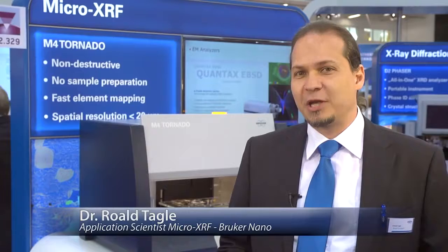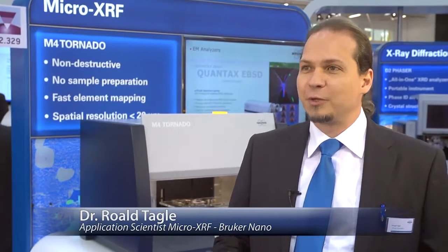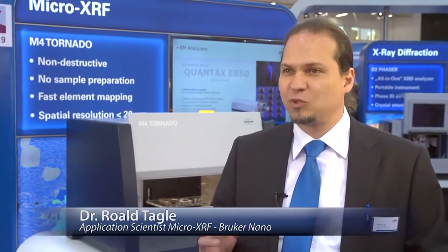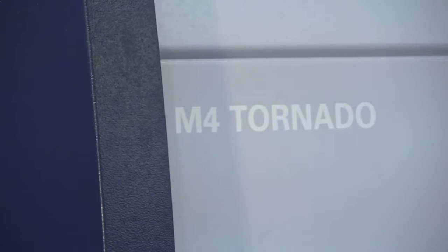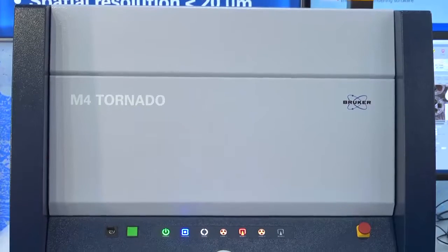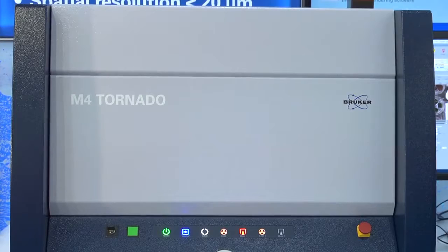The instrument that we are presenting today is called micro X-ray fluorescence. Just to describe it in a few words, what we have here is the possibility of getting X-ray fluorescence with spatial resolution. That means we are able to determine the two-dimensional distribution of elements on a sample. The interesting thing is that there is no one special application, but a variety of applications and fields where you can use it.